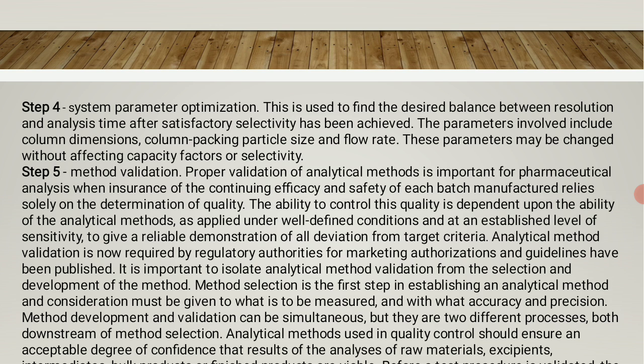The ability to control this quality depends upon the ability of the analytical method as applied under well defined conditions and at an established level of sensitivity. To give a reliable demonstration of any deviation from target, analytical method validation is now required by regulatory authorities for marketing authorization, and guidelines have been published.